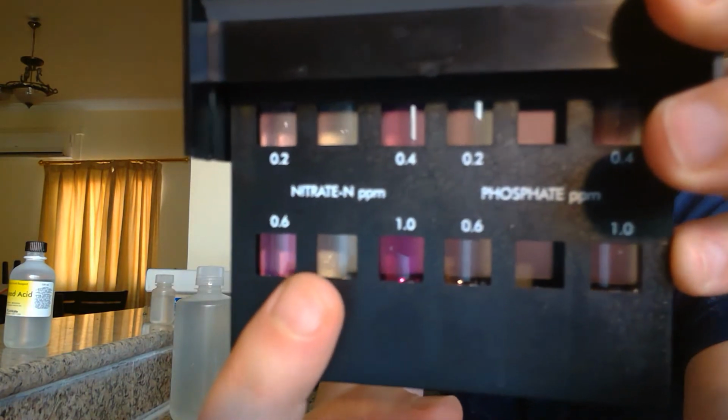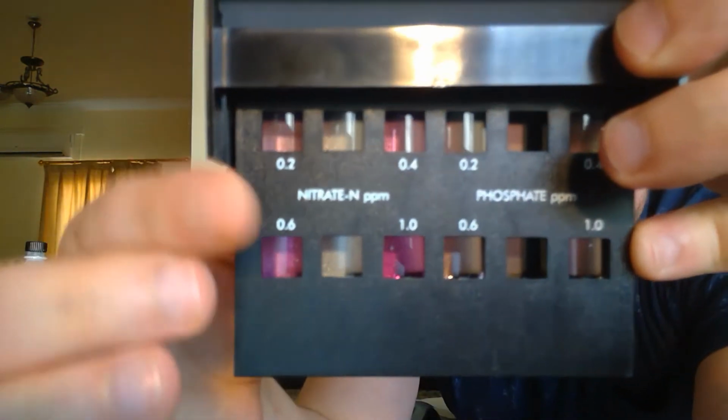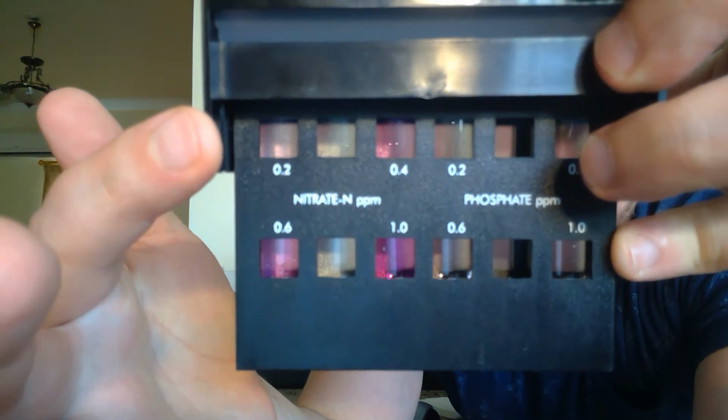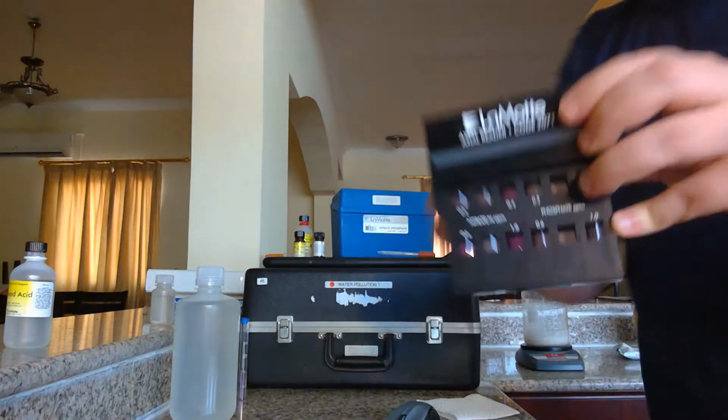In the middle is my water. It's not my sample. And you can see it's not quite the color of the 0.2, but it's nowhere near this. It's a little lighter than the 0.2. And when I say a little lighter, there is no color to this whatsoever.